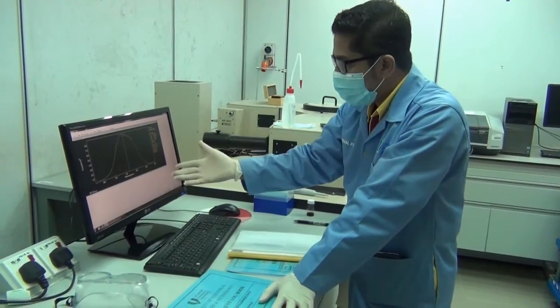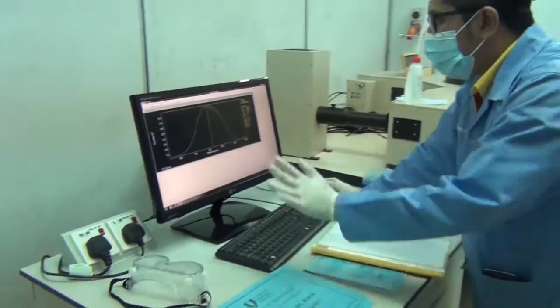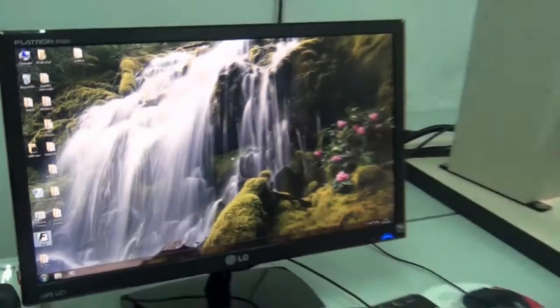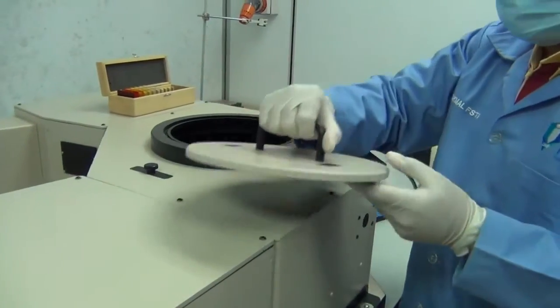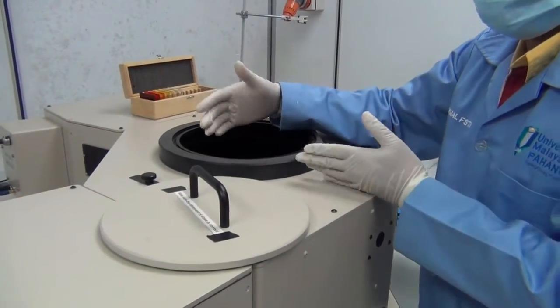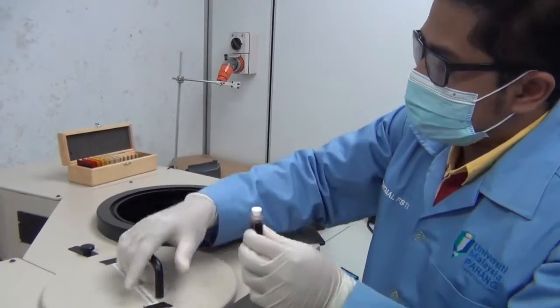Now you have saved the data. What you need to do now is close everything. How to close? Just click this button and click this button. Are you sure you want to exit? Yes. And don't forget to take out your sample. Simply open up the lid. Don't worry, we are using only visible light, no harm to your skin. It's not X-ray. Take out your sample.